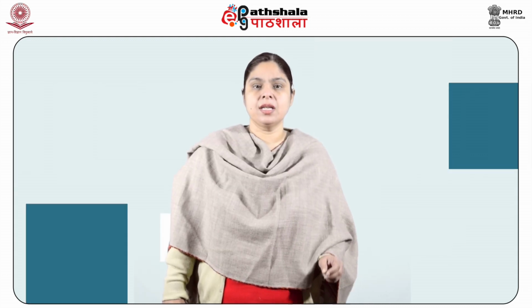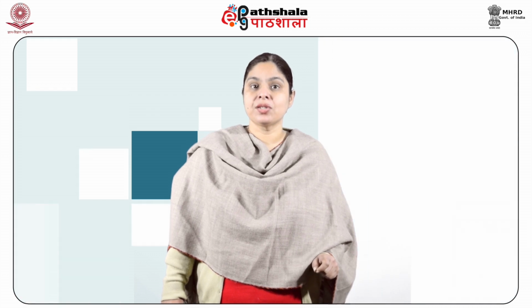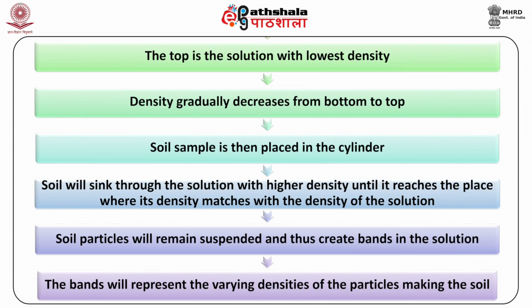In this method, a cylinder is filled with various solutions in a very specific manner, such that the solution at the bottom has the highest density, while the solution with the lowest density is at the top, and in between the density gradually decreases from bottom to top. The soil sample that we have collected is then placed in the cylinder.